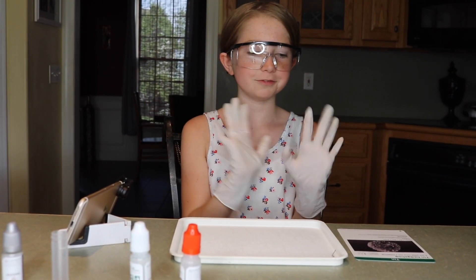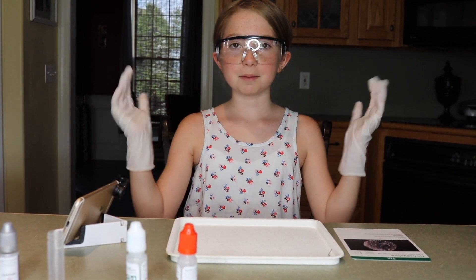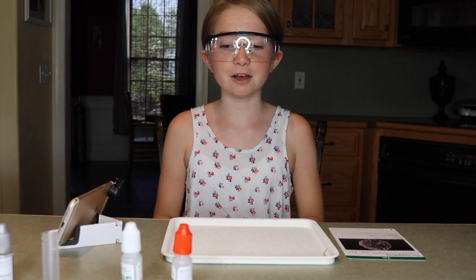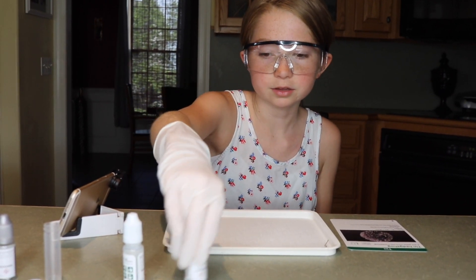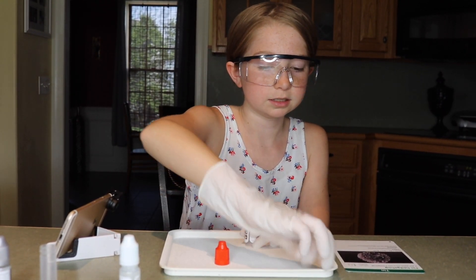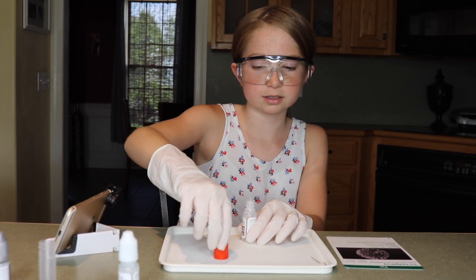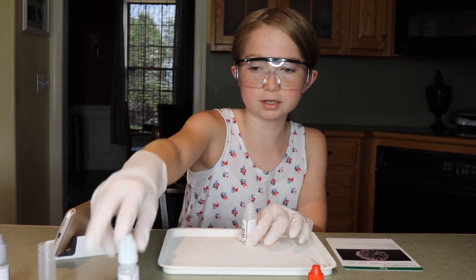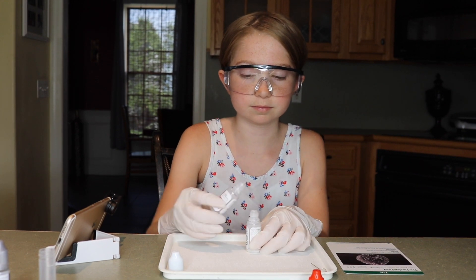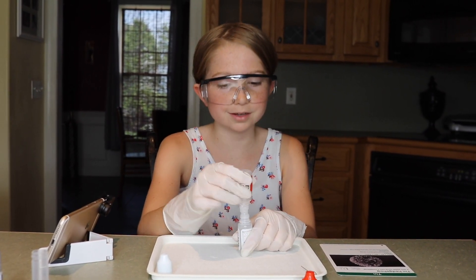I decided to do the tin hedgehog, so we have everything ready. I have my goggles, gloves, my hair back, and I think we're all ready to go. First, we're going to be taking the sodium hydrogen sulfate and we're going to be piercing it. And we're going to be pouring it into the tin chloride.